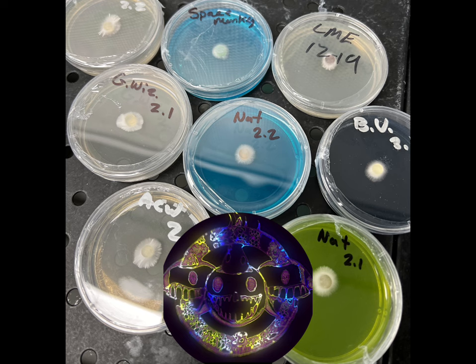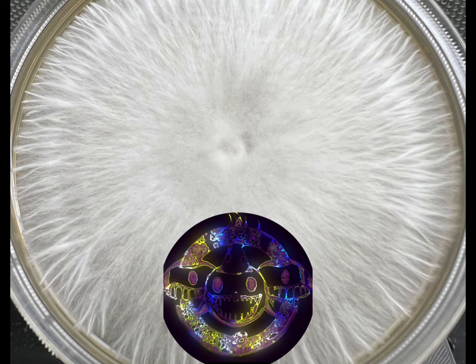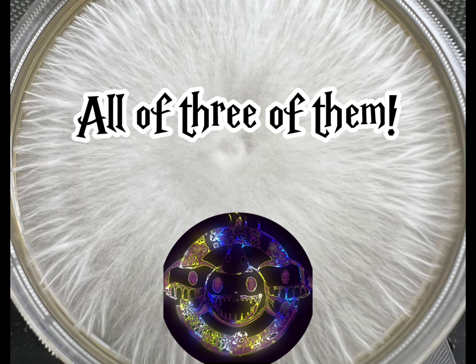If you've got all these agar plates that you've tested or made transfers to, what do you do with them? If they're not clean, you need to keep taking transfers - maybe put them to water agar. But if they're clean, you have several options. You can take that agar and put it to grain to inoculate it, much like you would a liquid culture. You can cut it again and make more copies for later. Or you could scrape some mycelium off and add it to liquid culture to make your own. Or you can do all three, and you still end up with that plate at the end to dump in the grain bag.